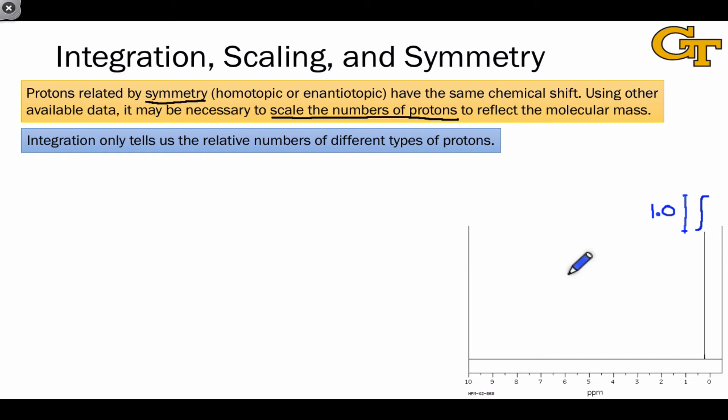But how many protons are in the actual molecule? Well, 1 seems odd unless it's something like HCl or HF, which would appear far more downfield than this peak near zero, and so those are unreasonable. So there's probably not one proton in each molecule of whatever sample we're looking at. In fact, this is a proton NMR spectrum for methane, which has four equivalent hydrogens. And so although the integration says 1, we need information about the molecular mass here. Here, it would be about 16 grams per mole. In order to scale this appropriately to give the total number of actual protons per molecule, which is four.